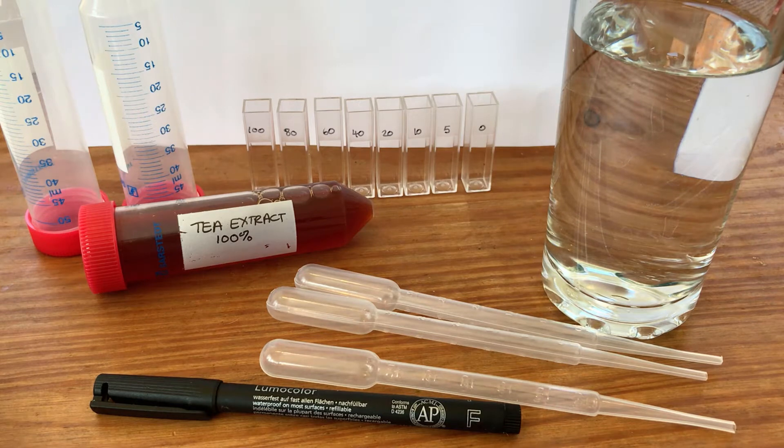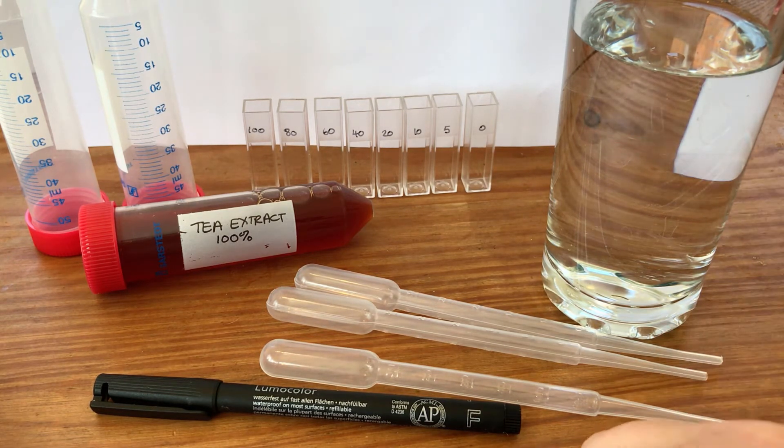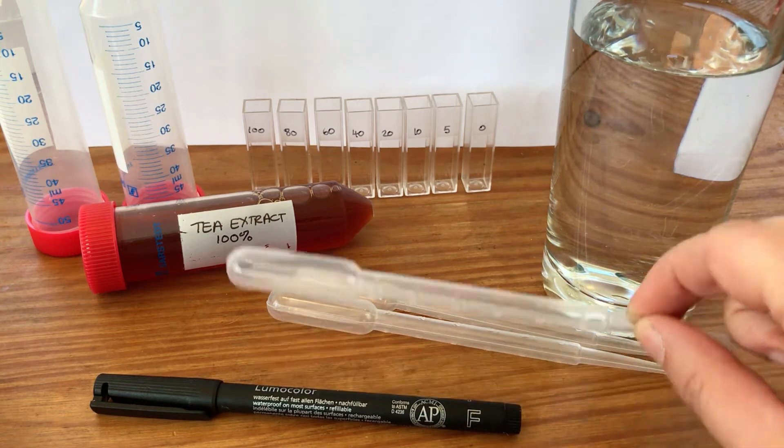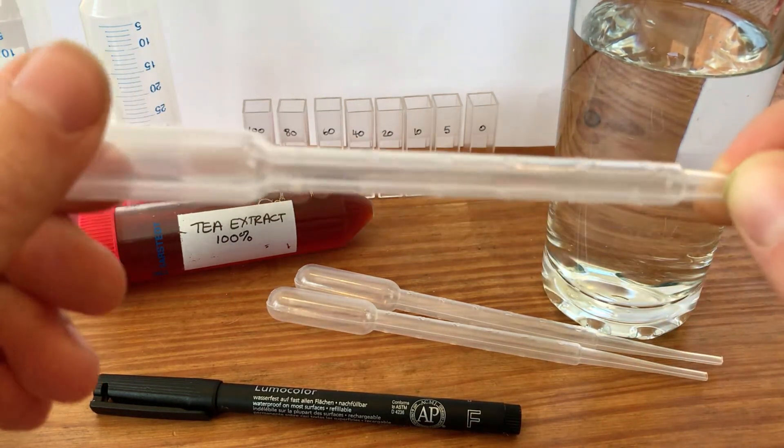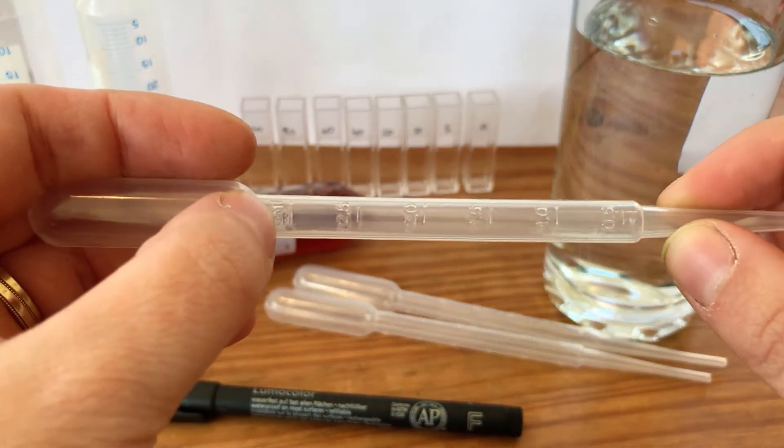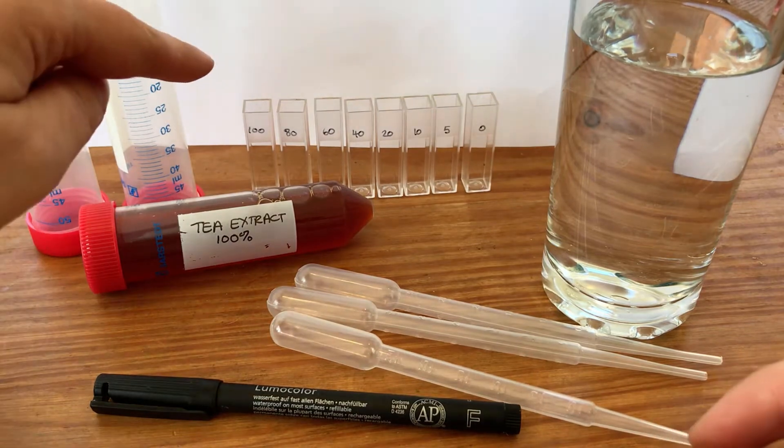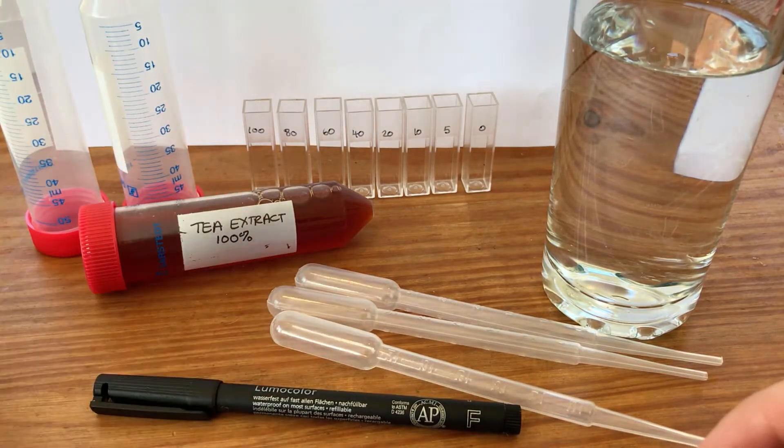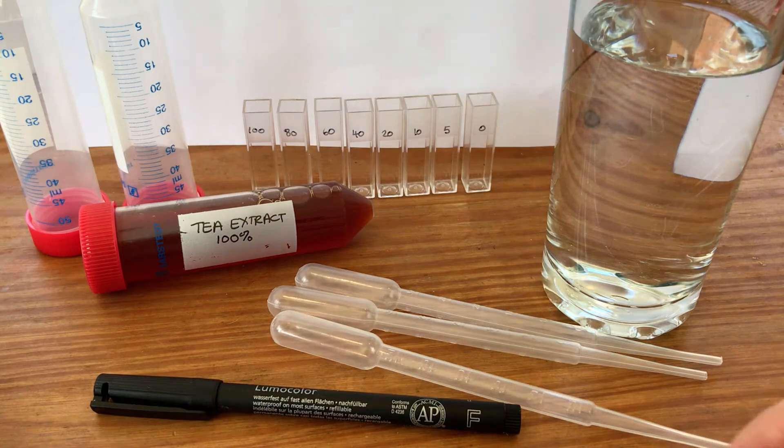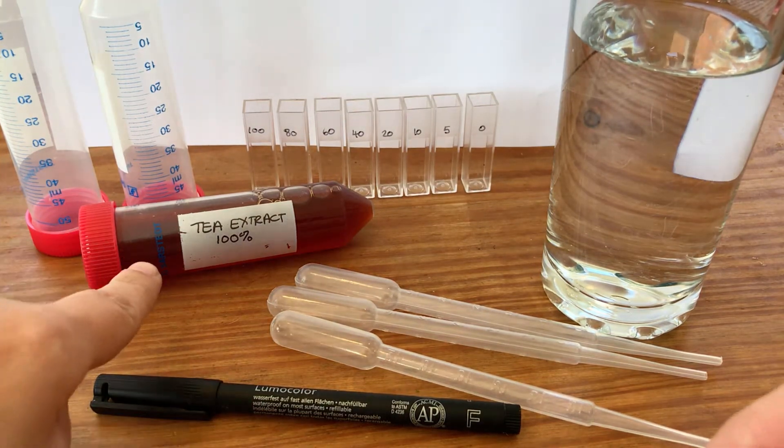For this you are going to need some water, just tap water, a marker pen for labelling things, some of these squidgy pipette things that will pipette up to three mils each, a bunch of cuvettes that I've pre-labeled with the different dilutions we're going to make up, a couple of these 50 mil centrifuge tubes, and then an extract of tea.